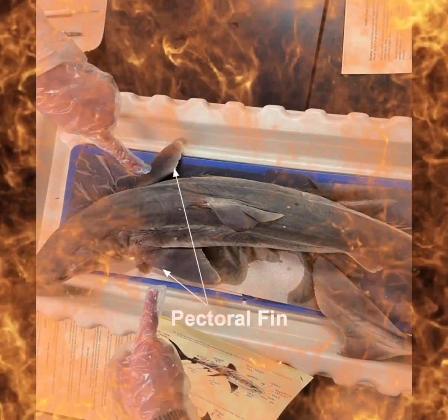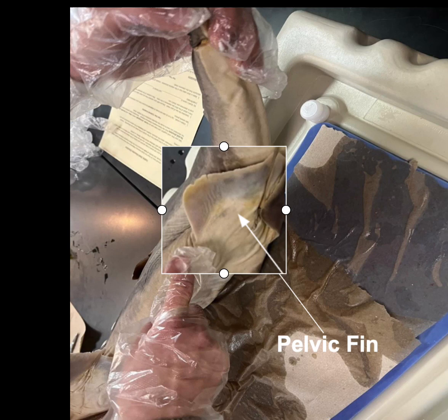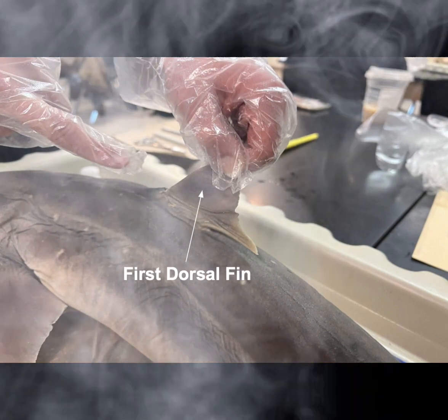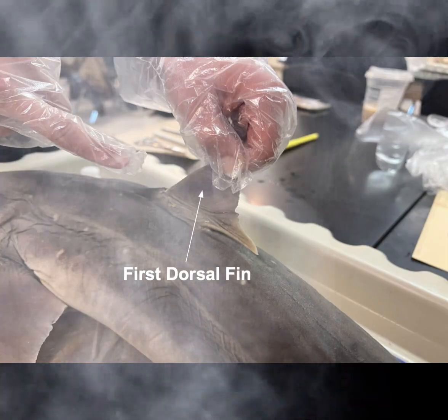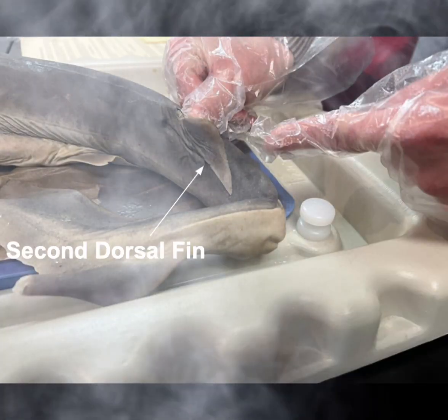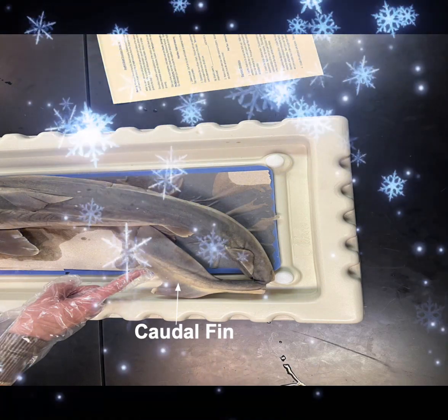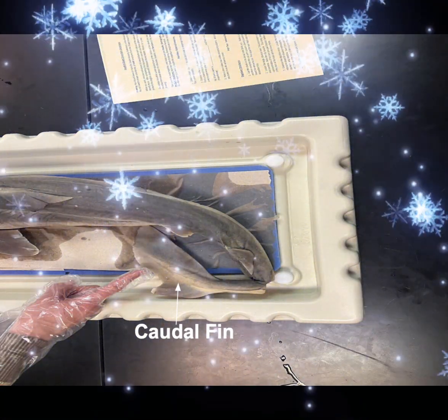The pectoral fin helps with locomotion and provides the lift that sharks require to stay afloat. The pelvic fin helps with stability and is located on both sides of the cloacal aperture. The dorsal fins help with stability. There are 2 dorsal fins on the shark, the anterior dorsal fin, which is slightly larger, and the posterior dorsal fin. Then there's the caudal fin, which helps with locomotion and is divided into 2 lobes, a large dorsal lobe and a small ventral lobe.